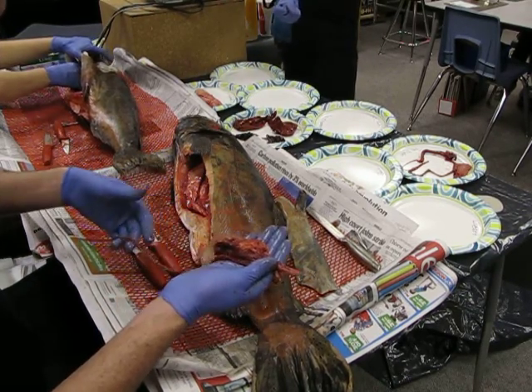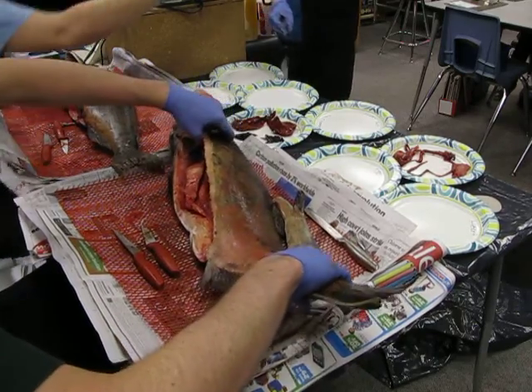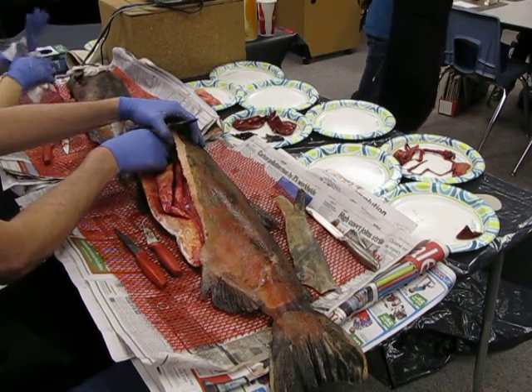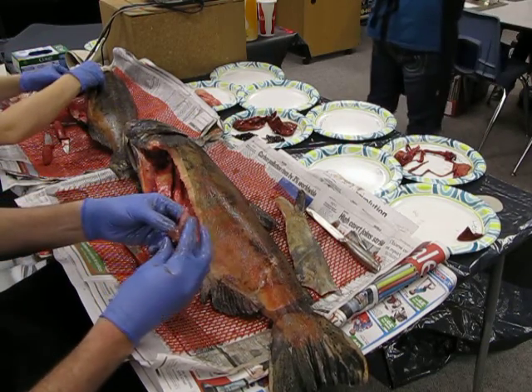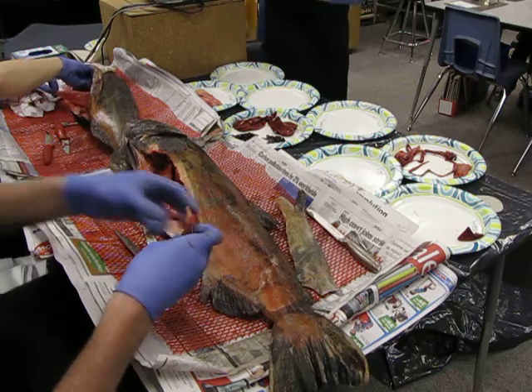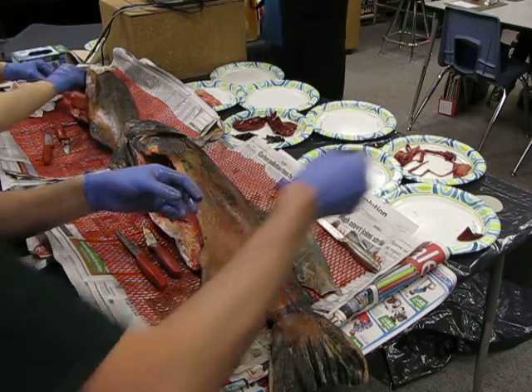When we get sick, if stuff does get past our mucus, if we have germs and bacteria in our body, then our body sends a message to the spleen and it says, make white blood cells. White blood cells are fighter cells. So those white blood cells get sent out and they fight and attack all that bad stuff in our bodies to make us healthy again. It's true. And in salmon, their spleen does the same exact thing. So if something gets past that mucus and those scales, something gets inside of them, their spleen makes white blood cells and it fights off all the bad stuff.